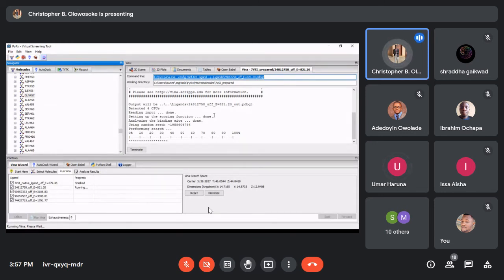So I think that's where your issue is. You have to go back, look at the information about the protein that you are downloading, and check if they are homodimers or heterodimers. Identify the binding site in that amino acid. If it does not have a binding site, that is because it was not crystallized with a ligand.